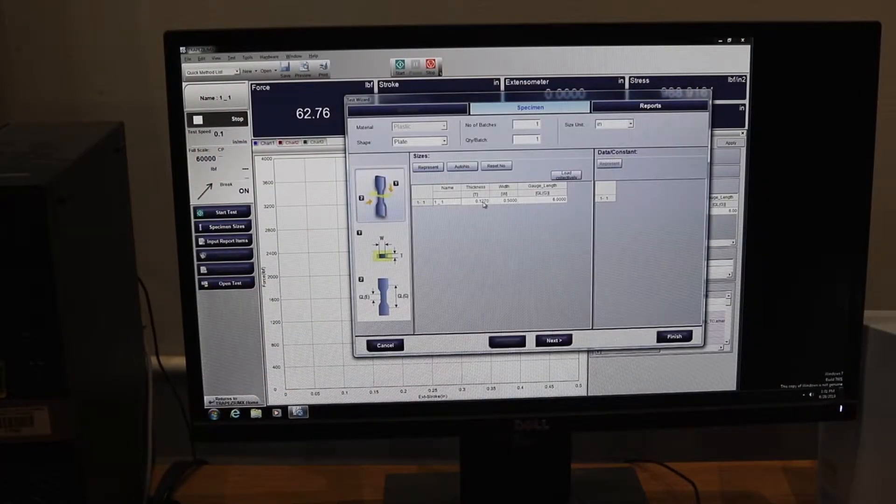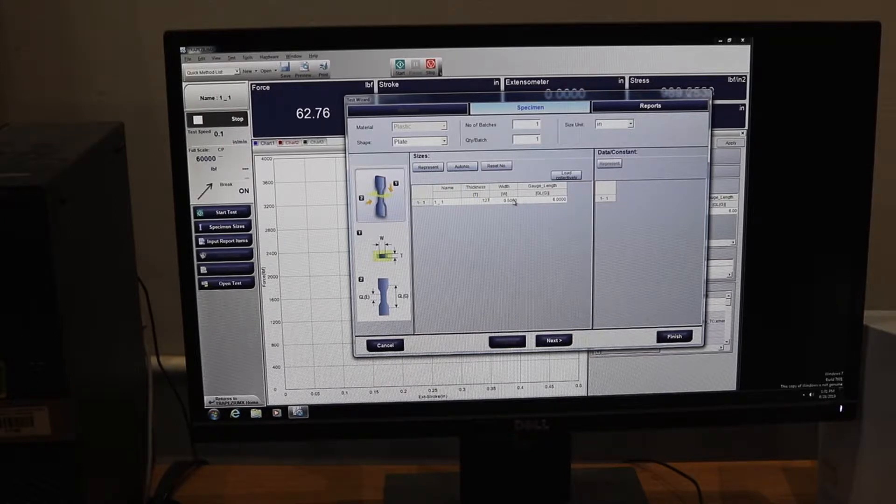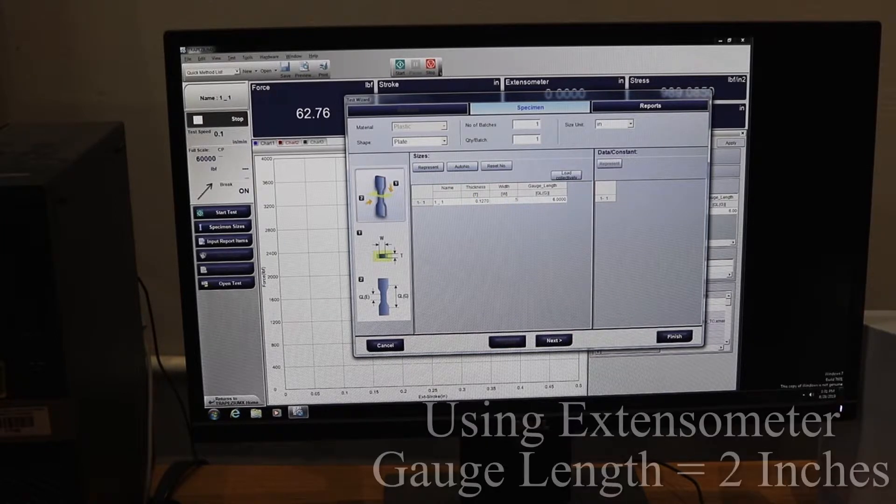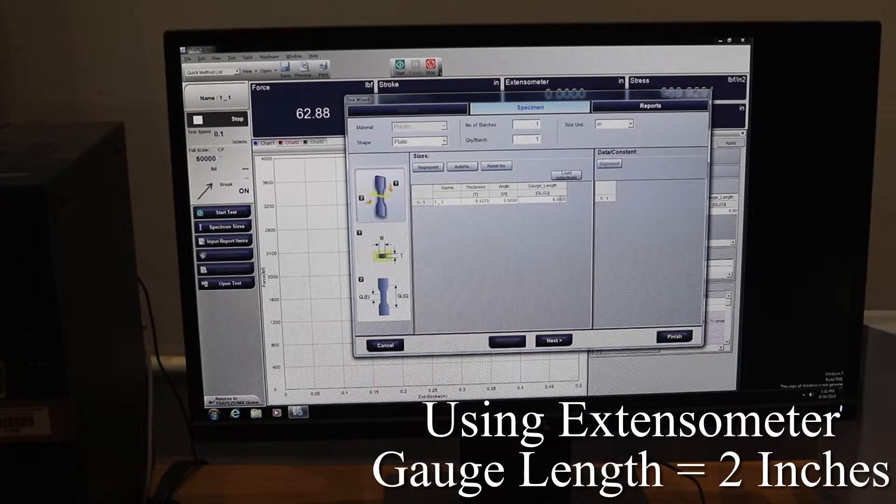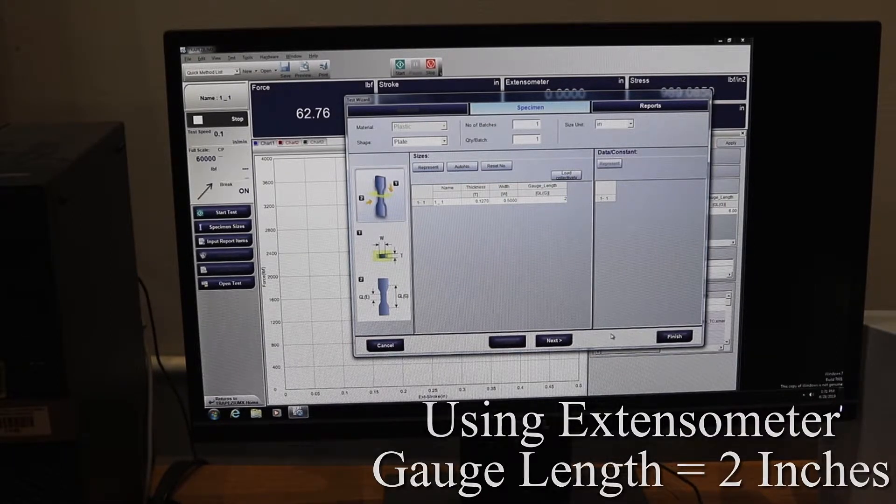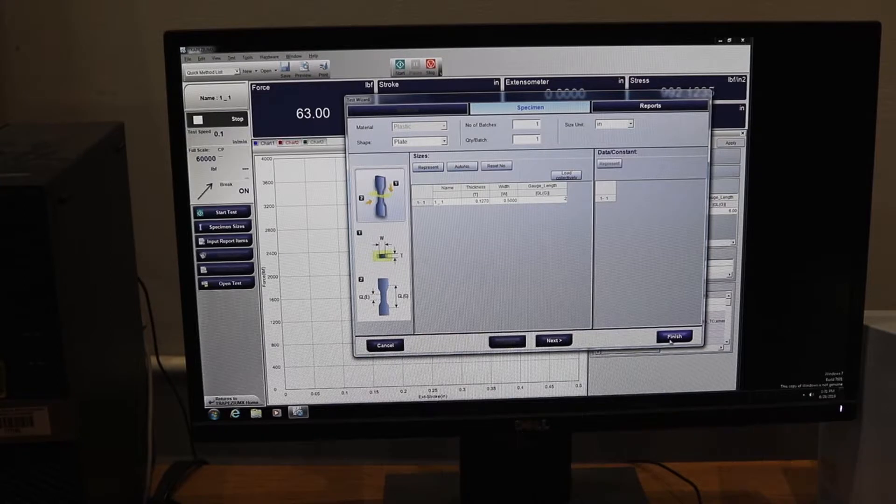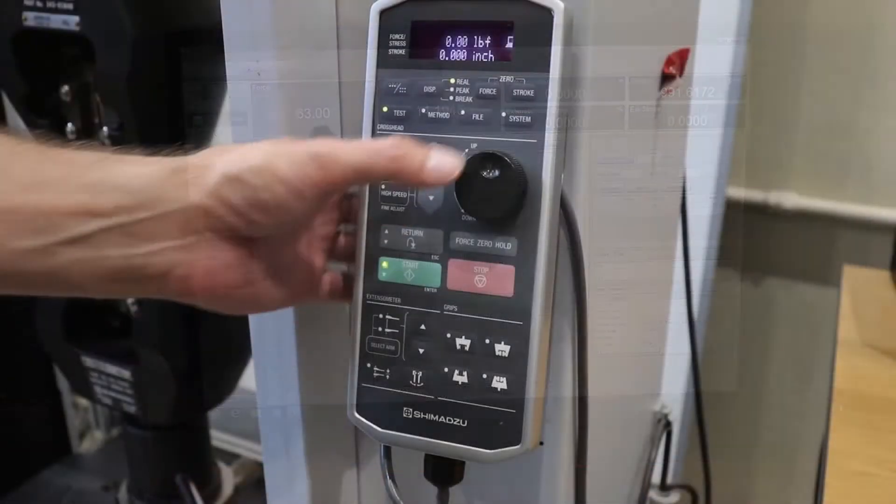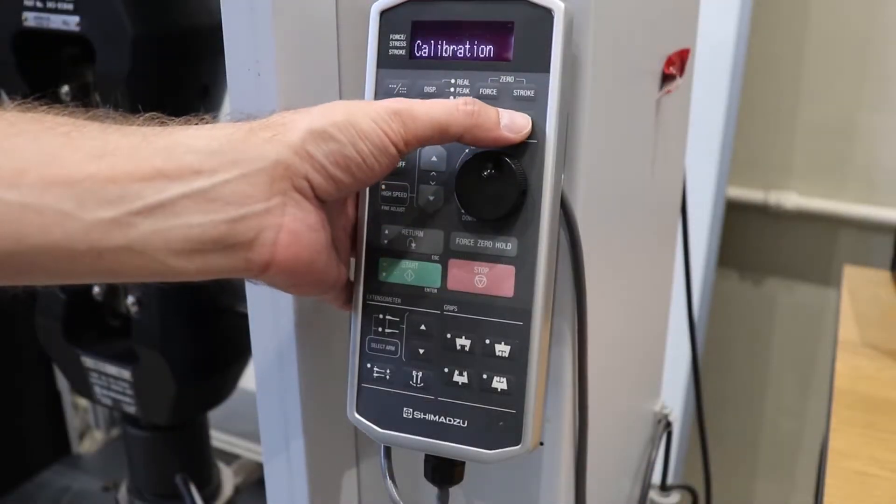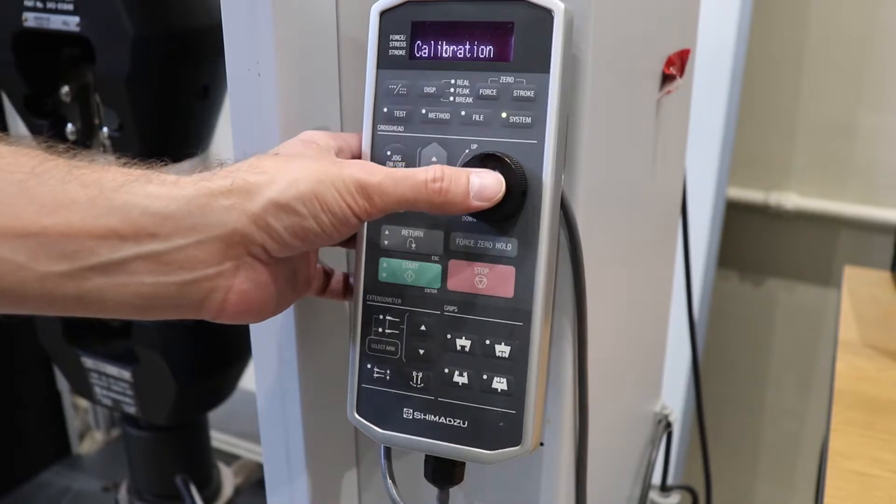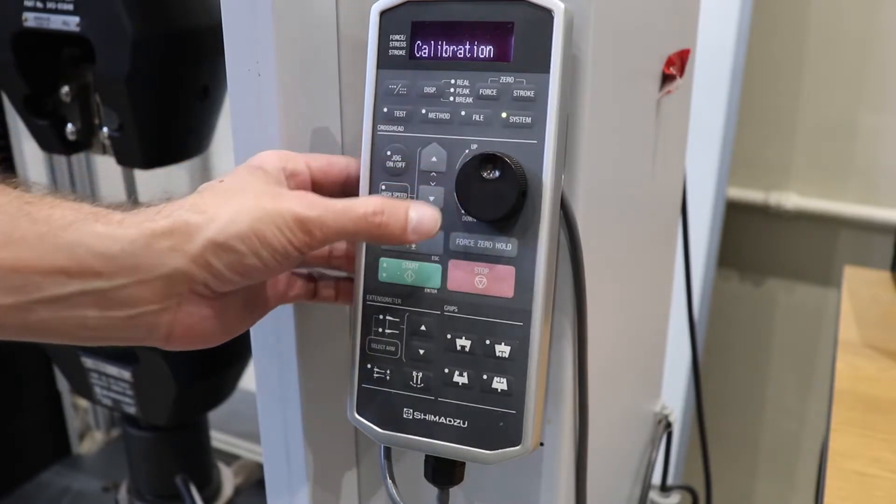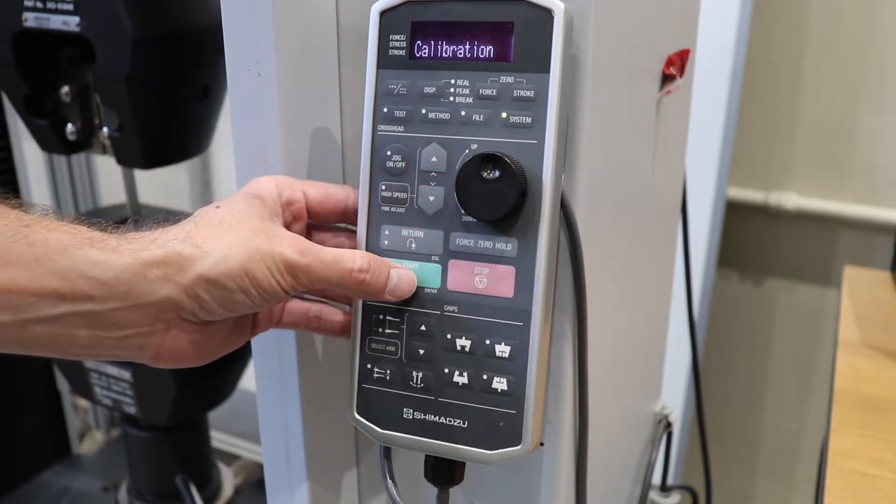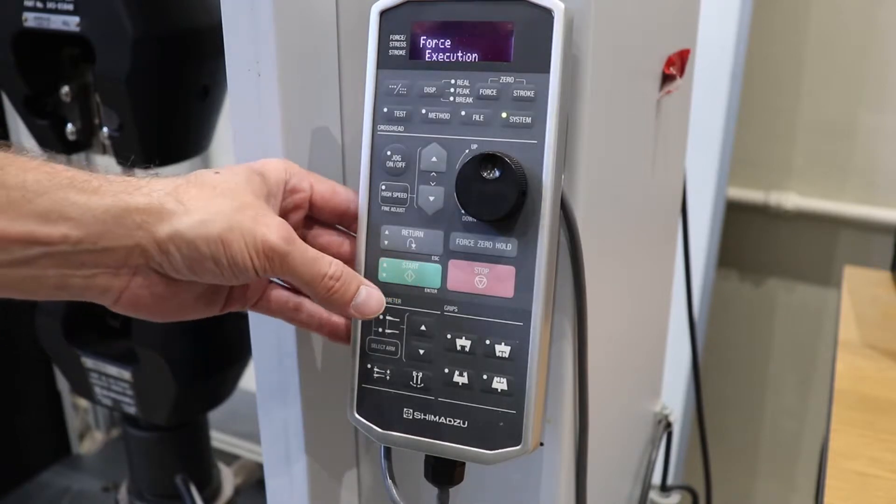Click on specimen size. For the gauge length, since we are using extensometer, it will be two inches. Now we will go about calibrating the machine. To do so we click system, press start, force execution should pop up and press start again.